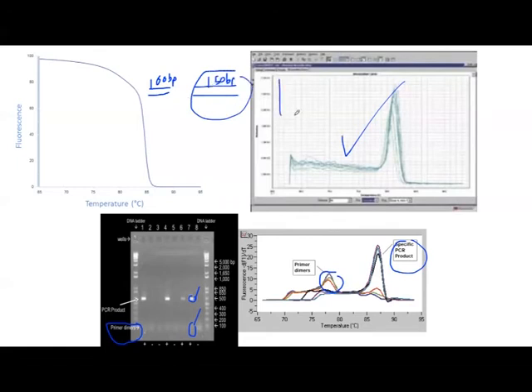So in this protocol, you're going to get two peaks. This is for 150 because you need a higher melting temperature, and this is for 100. So you can genotype with this. If you only get 100, you can say, okay, this is homozygous 100 and 100. If it is heterozygous, you can say this is 150 over 100. So again, you can still use SYBR Green to genotype SNPs or a size difference in the PCR products.